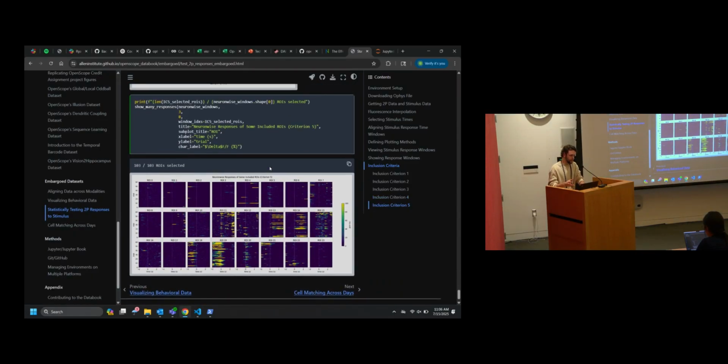So I wanted to show you that just to demonstrate that this is also an important phenomenon in calcium imaging. And then the other thing is that this notebook could actually be used to literally reproduce the findings in a paper really quickly. So you could do this with a number of other things that rely on open data.